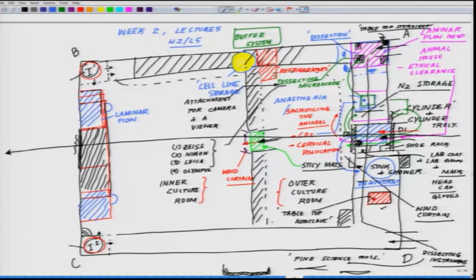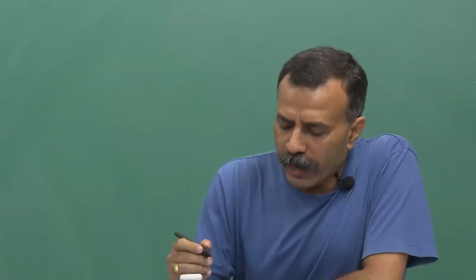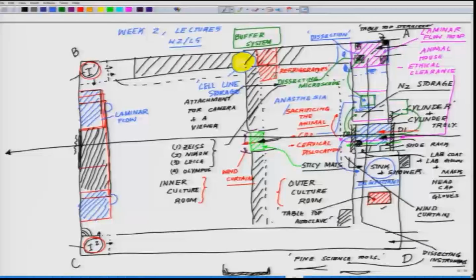Now, whether you are doing a cell line culture or you are doing a primary culture, one thing is very critical, you have to observe the cells. As you are passaging the cell or you are plating the cell, you need to observe the cells time and again. So, you have to have a microscope, and I will recommend, going by the same logic, where you want to put it, prefer something which is not coming in the direct way, because you are viewing the cells. So, it should not come on this way. So, your options are on this countertop, somewhere here on this side, or somewhere on this wall, either this wall or that wall, whichever suits your requirements.